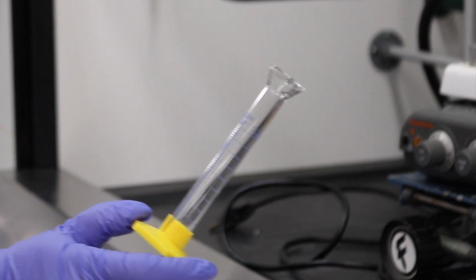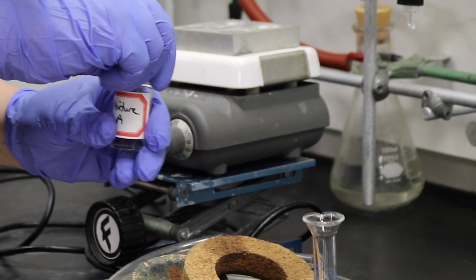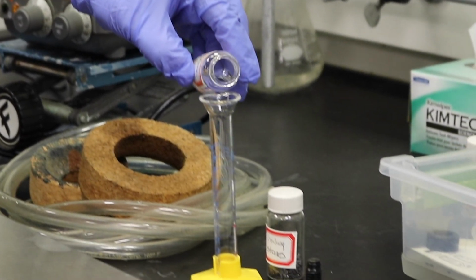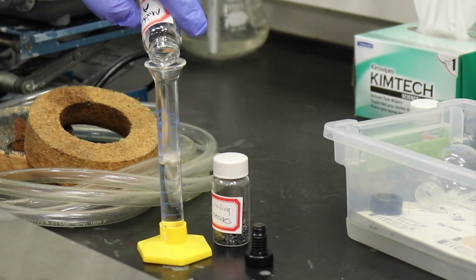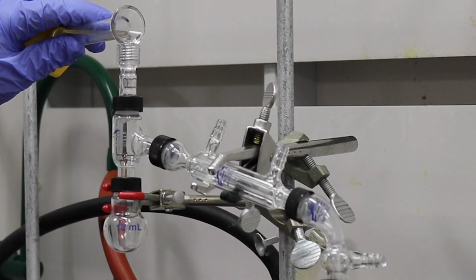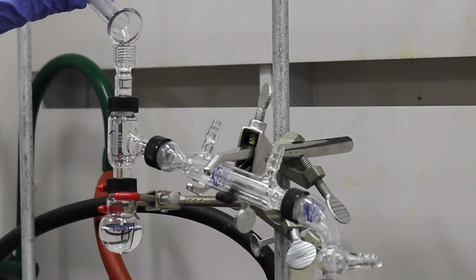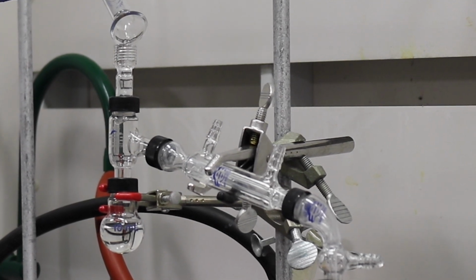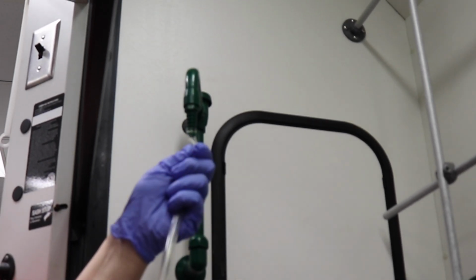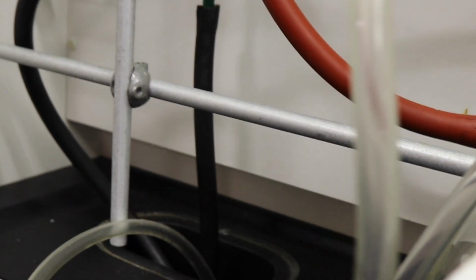Then we'll take our graduated cylinder and add mixture A to it. There should be about 8 milliliters of mixture. And there is 8 milliliters. We pour the mixture into the round bottom flask, as you can see here, and it's all in. Once that is in, we'll take our thin wall tubing, hook it up to our water, and run the water into the bottom of the condenser and then out the top and into the cup sink.